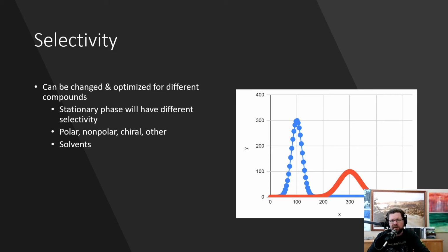So if you buy a chiral chromatography phase, it's going to be very, very expensive. If, on the other hand, you buy a non-selective phase, like, for example, silica, and you still have enough selectivity to make a separation, then you buy the inexpensive phase. And that's what a lot of people do in remediation of THC from CBD. They buy the inexpensive phase and they have a method, which is probably a normal phase method, to do that separation.